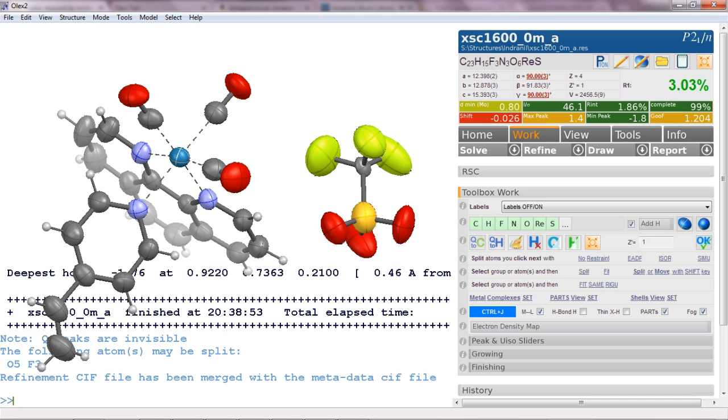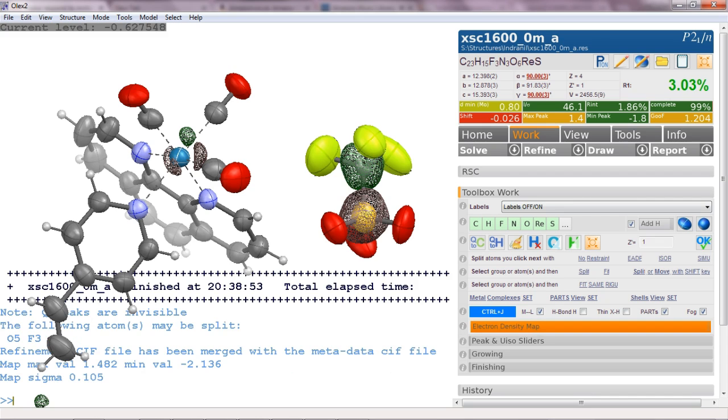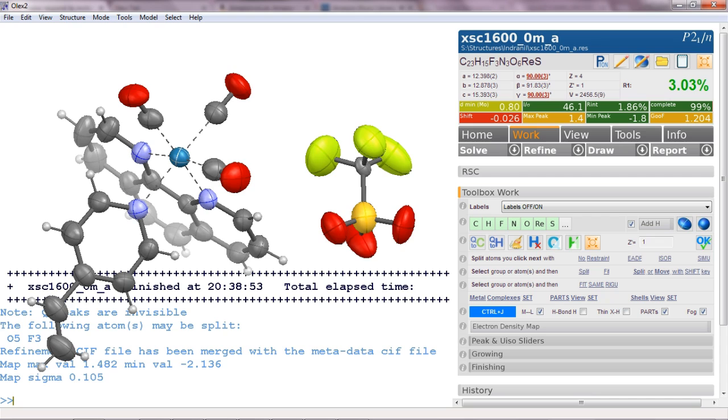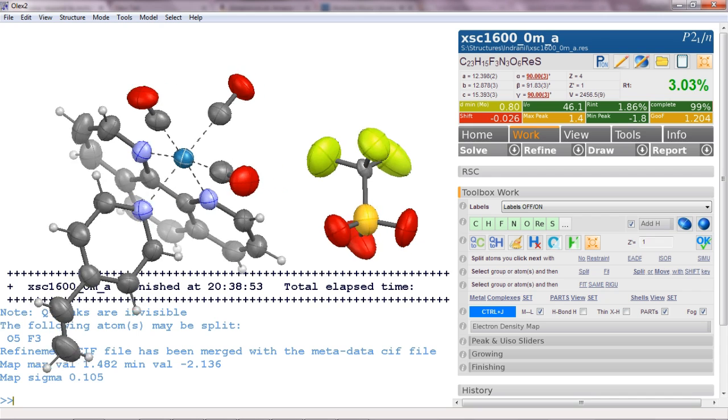And if you look at the electron density map we can clearly see we assigned too much electron density on the sulfur and not enough on that carbon. So what's happening here is this is a head over heel disorder of the triflate and that's quite a common occurrence.